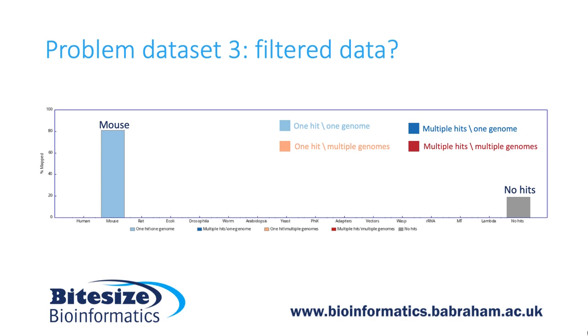Obviously, this is not what you would expect to see, and of course, if you wanted to do your own analysis on the data, you have to now bear in mind that it may have been pre-filtered or manipulated in some way, at which point you start to lose confidence that the conclusions you reach are actually valid.